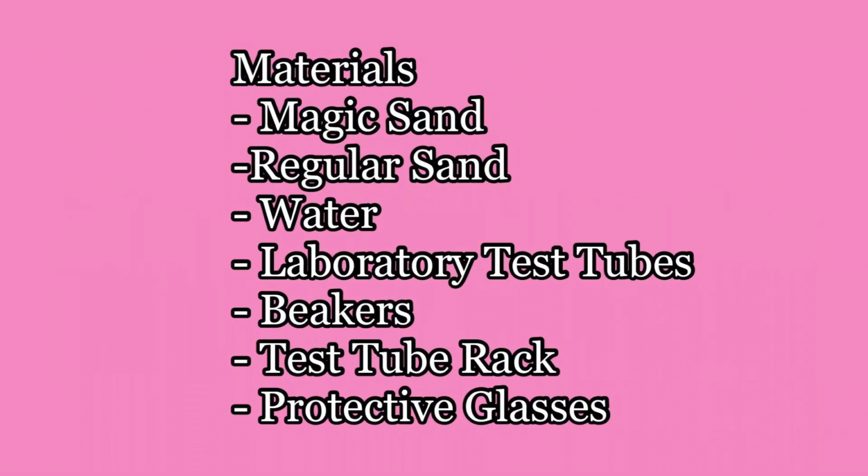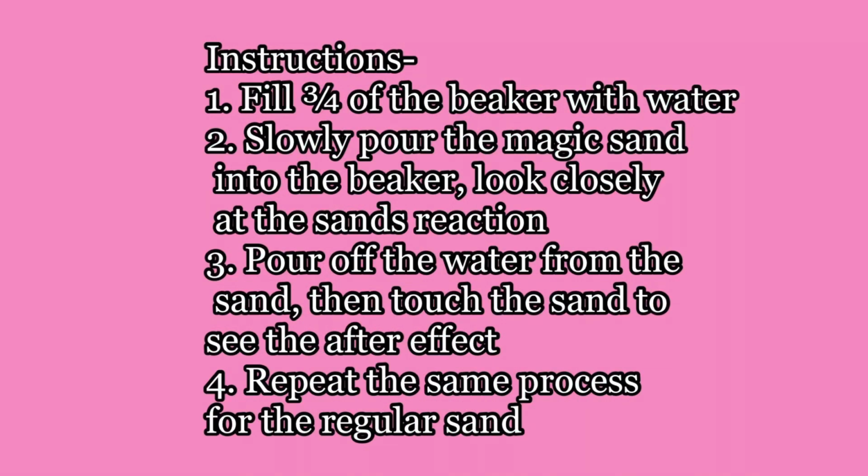These are the materials that we used in our video, which is the magic sand, regular sand, water, laboratory test tubes, beakers, test tube rack, and protective glasses. These are the instructions. Please pause to read them.